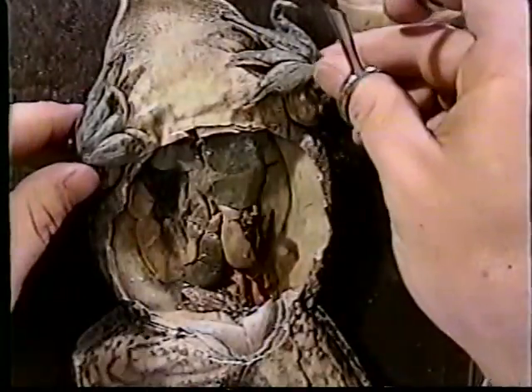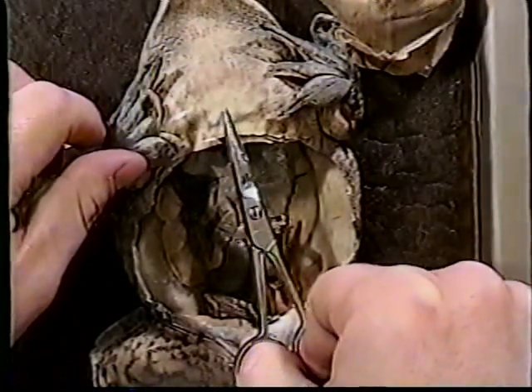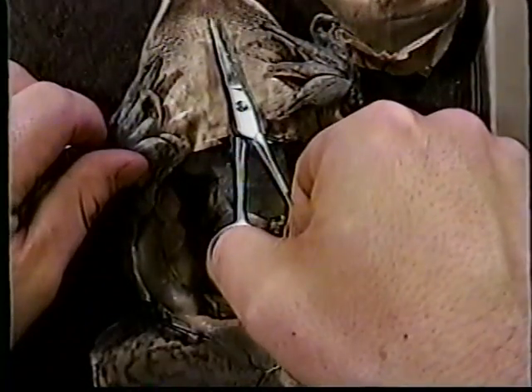Because of the amount of room that I have to work with, I have made a decision to clip off the skin instead of pinning it to the dissection tray. I now have a very clear look at the interior anatomy of my specimen. I will continue to cut toward the mouth to get some of the more hard to reach organs and organ systems into view.